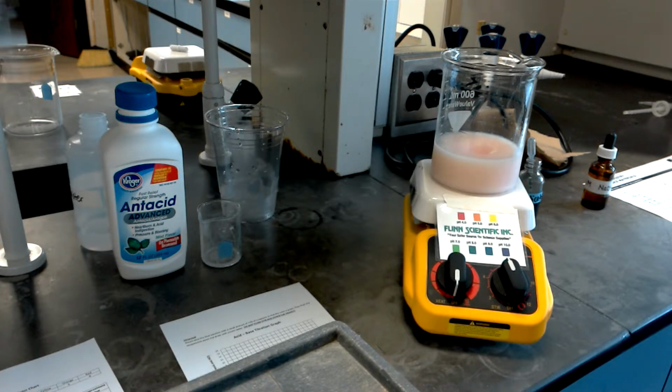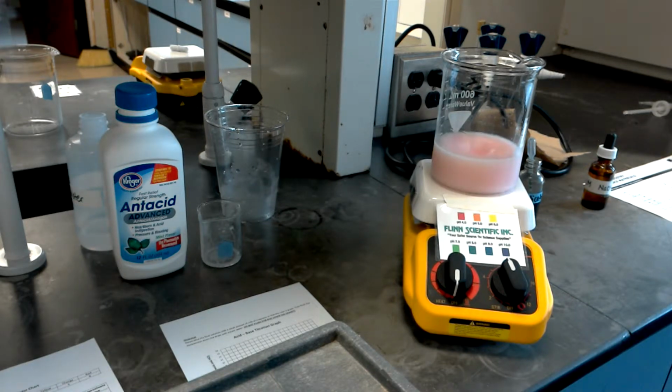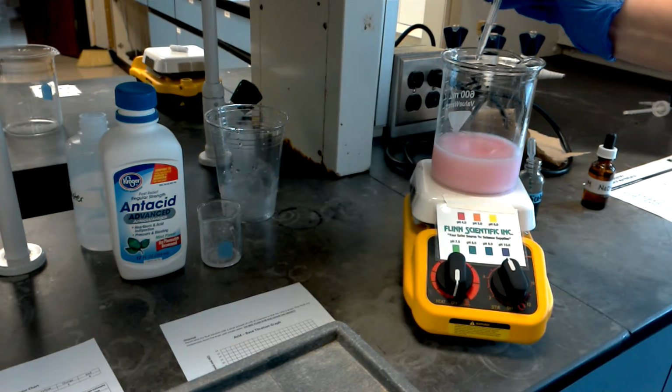36. 38. 40. We're not at a pH of 4 yet. 42. You might have to add a few lines to your data table. 44. 46. We're getting closer to 4. The pH of 4. 48. This took a while. 50.